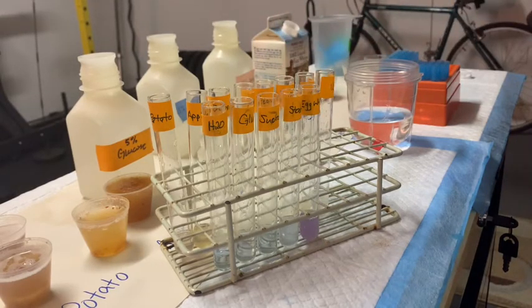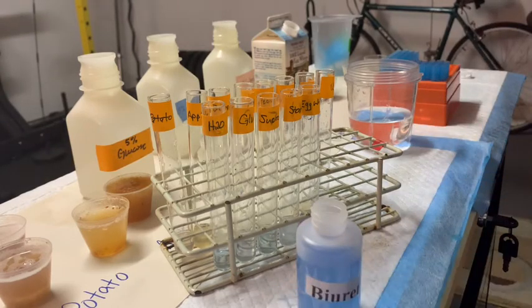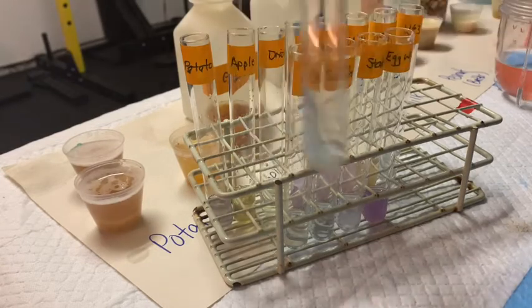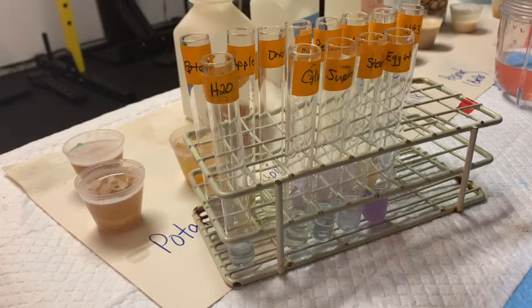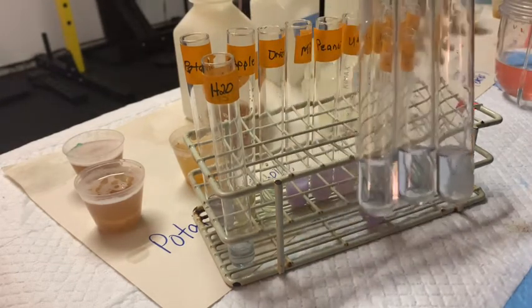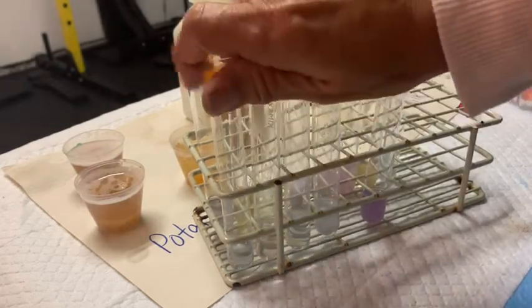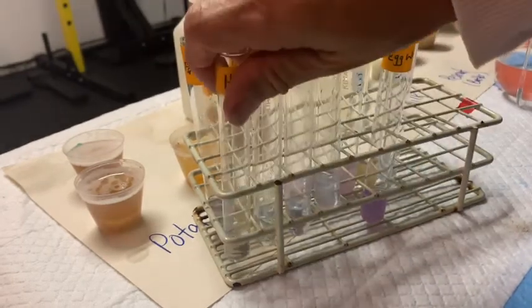I'm going to continue down the line and add the reagent to our food juices — I'll add it and then we'll go over each one. So let's see what we ended up with. We start off with our water, which is our negative control, and it should stay about the same color as the Biuret reagent — and it does. Glucose, sucrose, and starch don't change color either; they're still the original color. So those are going to be our negative results.